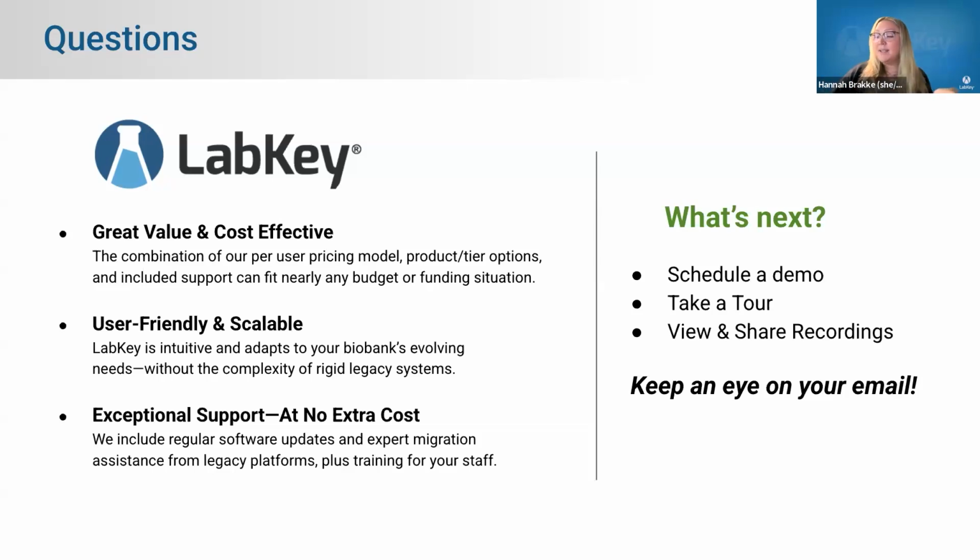Great. So what does validation of our software look like? We talked a lot about data validation and being able to validate the data coming in. But LabKey also offers a software validation pack that we actually work with Compliance Path on. Our third-party partners effectively can provide an installation qualification and an operational qualification pack with each release. And then optionally, folks can work with Compliance Path to do a process qualification, or they can do their own process qualification as well.